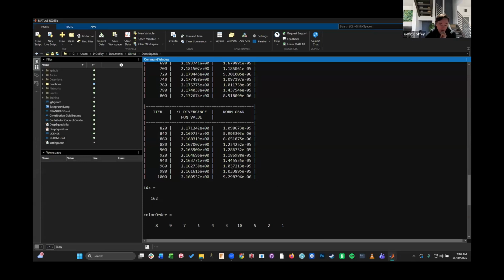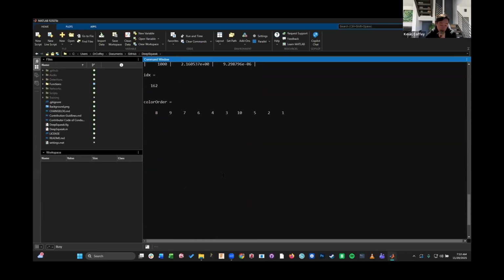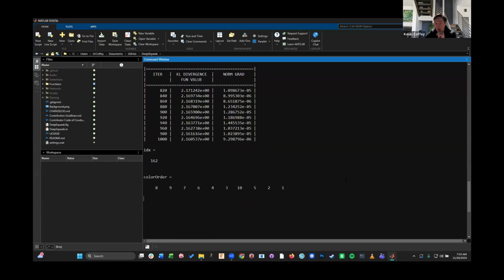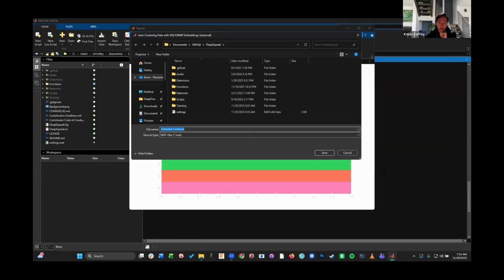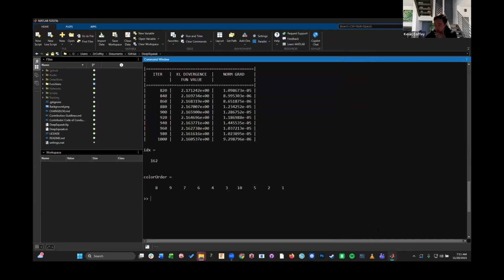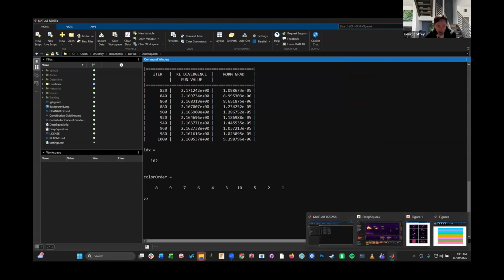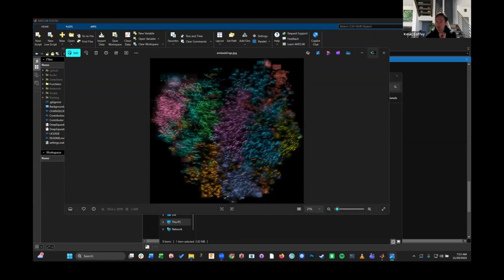But this actually already completed the entire TSNE calculation and is basically just trying to save the image, which takes a little while because it's a large image. So we can save that embeddings image, which is the call categories here. Once you do this, you can resave your extracted contours. I'm not going to do it right now because saving takes a second, but it will save that with all of the actual embedding values so that if you wanted to load that later and make new graphs using those embeddings, you could.